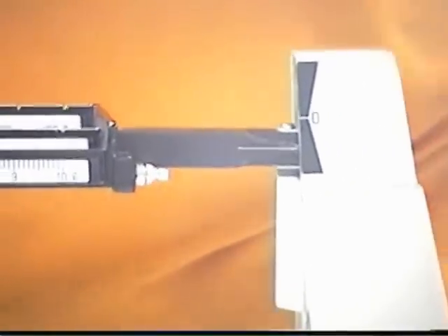These three here are called the Riders. And these three metal beams here are called the Beams. This part also here is called the Pointer. And this one here is called the Scale. So that is all about the different parts of the Triple Beam Balance.